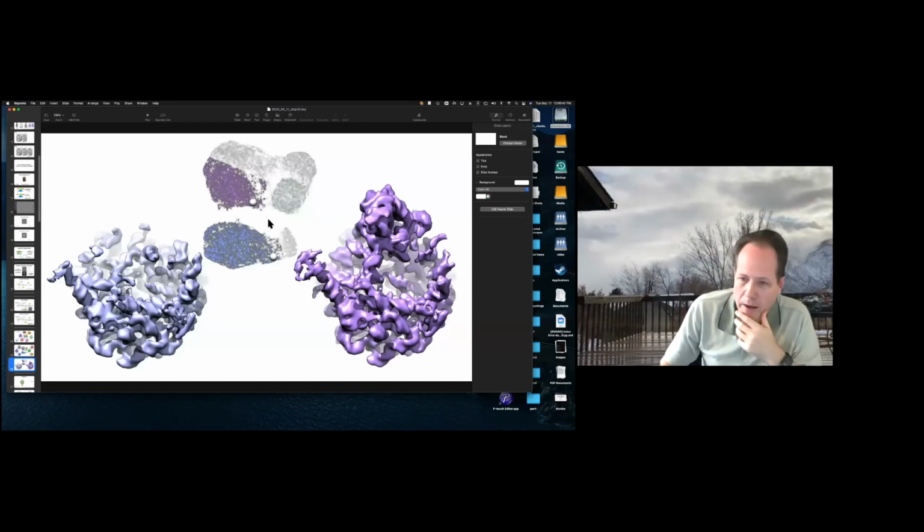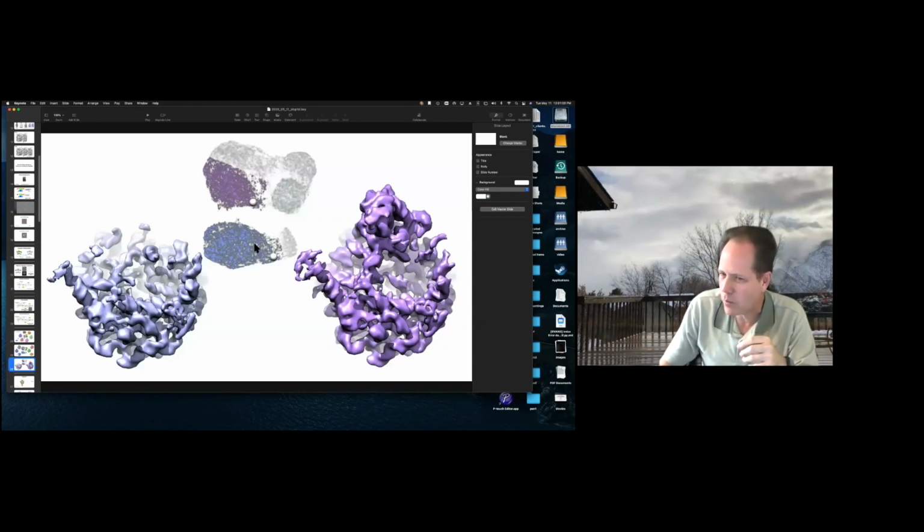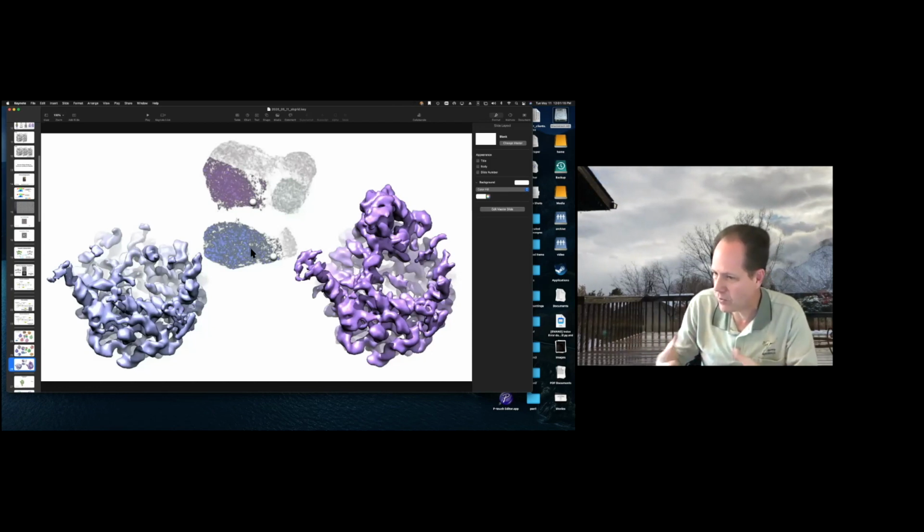Like, I understand what you're saying. So this particular system isn't a great system for considering those issues, to an extent, because what you're looking at here is really discrete variability, right? Basically a ligand is present or a ligand is absent. It's not waving motions in space and that sort of thing. Now, within one of these local blobs, you will see some local motions which are probably also involved in the function of the structure, but the big barriers that you see here are basically ligand binding events. So they're things that shouldn't be continuous.